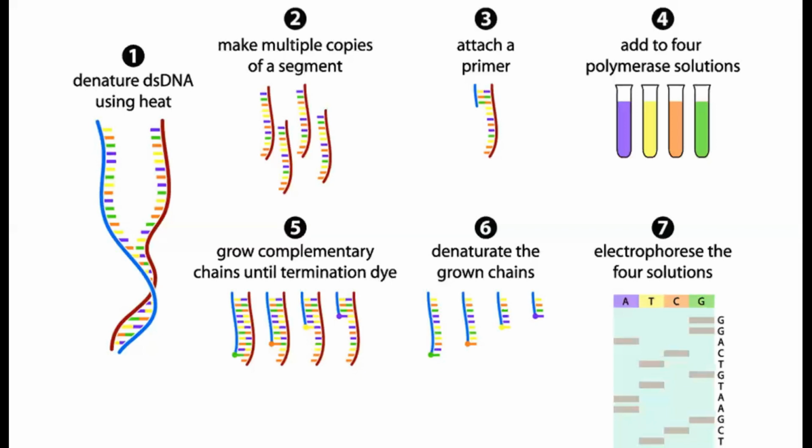So the first reaction will happen in the first test tube, the second reaction will happen in the second test tube, and so on and so forth. So you have to wait for quite a long amount of time for your process to run, and then you will go for your electrophoresis and then radioautography. So it was again a time consuming process, and people started figuring out that this is not the right way we should do it, because it is consuming a lot of time and we don't have this much time to spend. We want something new which could process our result much faster.